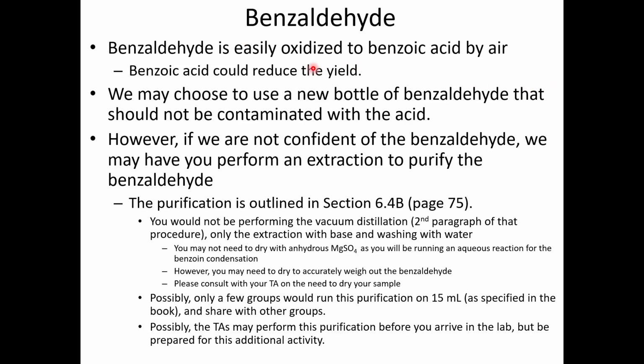Benzaldehyde, we already covered this in the benzaldehyde purification lab, but I'm going to go through it very quickly. As you may remember, benzaldehyde is easily oxidized to benzoic acid by air, so we need to purify it before using it. We may choose a new bottle of benzaldehyde that should not be contaminated with the acid.